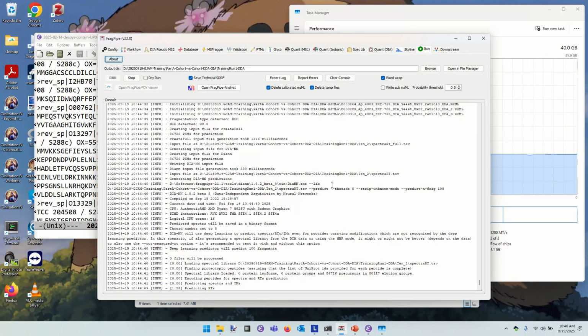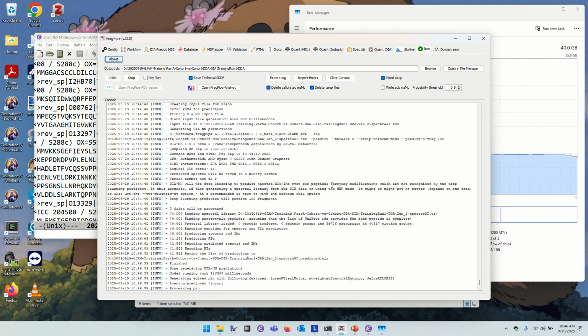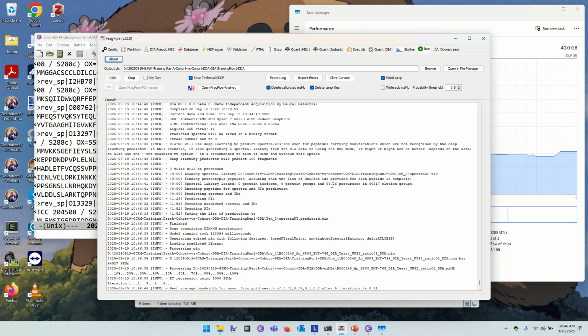So yeah, in my case, maybe it's also good to mention if people have profile data in the Orbitrap. Oh yes, in this case, the data are mzML format. So I've already reduced the size of the raw file by peak picking it to make the mzML files.